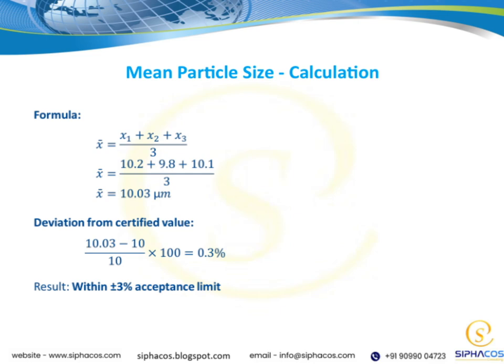It's important to highlight that accurately calculating the mean particle size allows us to compare different samples, optimize processing parameters, and ensure consistency in production. This step connects directly to our overall goal of controlling material properties and achieving desired performance in the final product. So, in summary, understanding how to calculate the mean particle size is fundamental for quality control and process optimization in our material development.